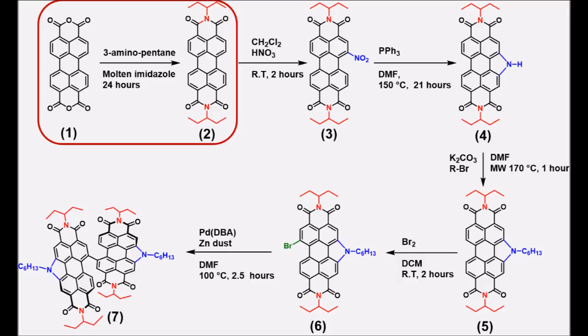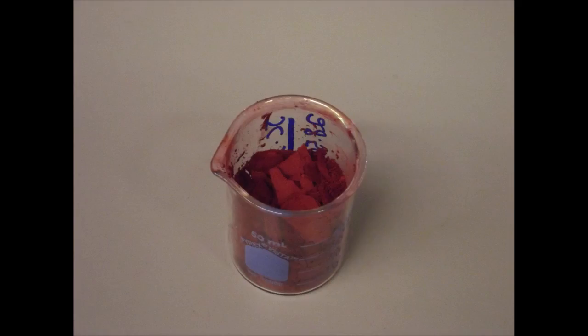In this video, we will be alkylating perylene dianhydride using ethylpropyl amine to form ethylpropyl PDI. Ethylpropyl PDI is a very useful red dye that is often used as the starting point to synthesize PDI-based materials.